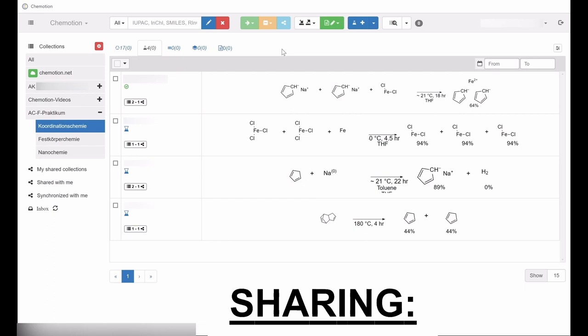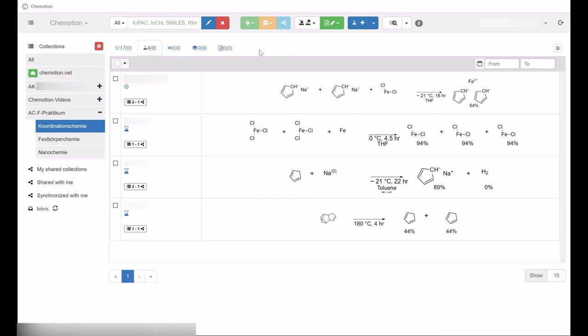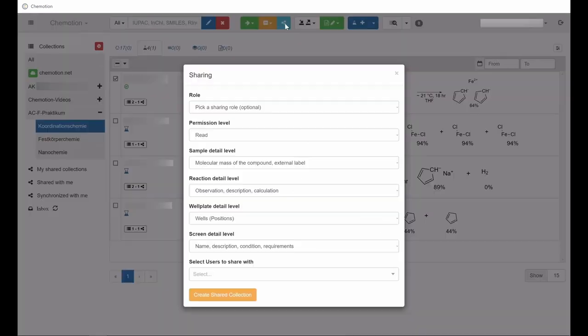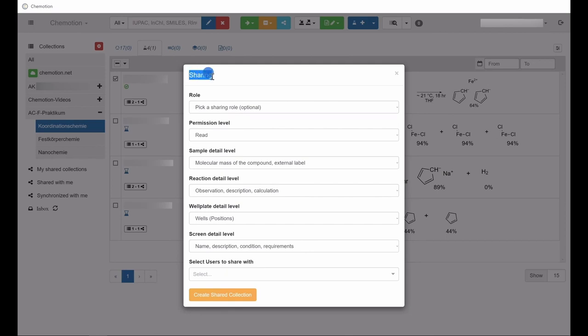To share selected items, click on the light blue icon in the upper action bar. As a result, a new window containing various options will open.